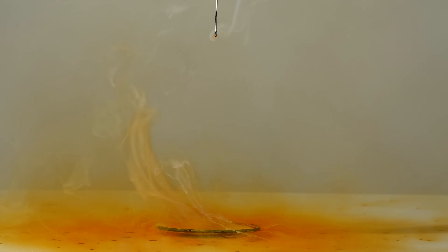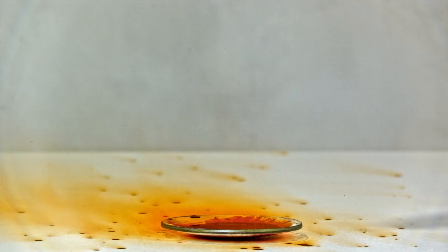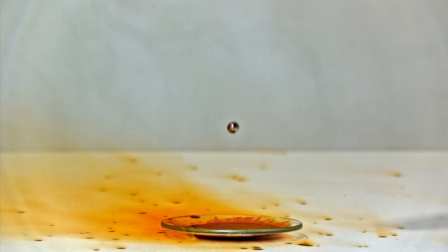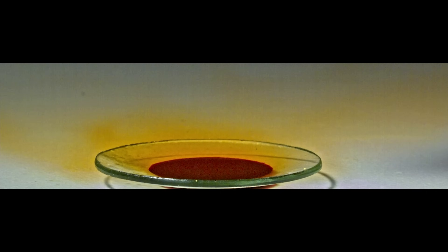And now the reaction with bromine. As one would expect, upon contact with liquid bromine, this alloy instantly explodes. Even in slow motion, it's clear that the explosion occurs immediately the moment a drop of bromine touches the surface of the alloy.